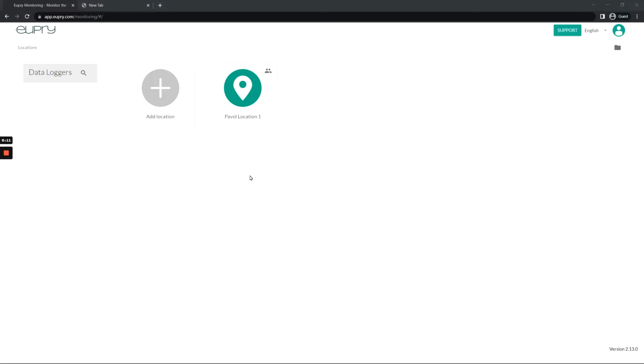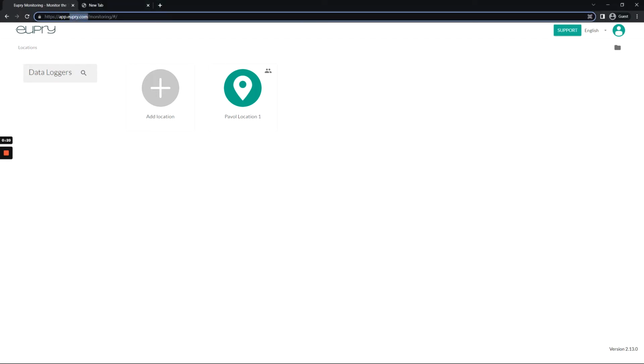In today's video I would like to show you how to install a data logger into your Eupry monitoring web app. First of all, you need to go to app.eupry.com. After that, you will need to log in with your email and with your password.